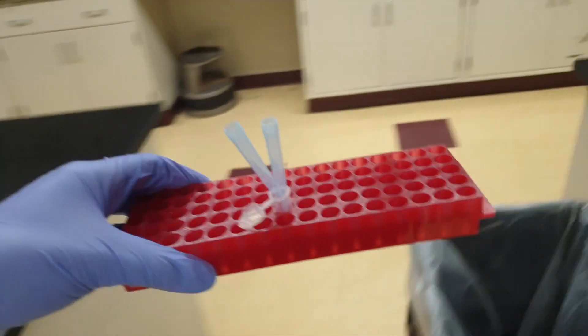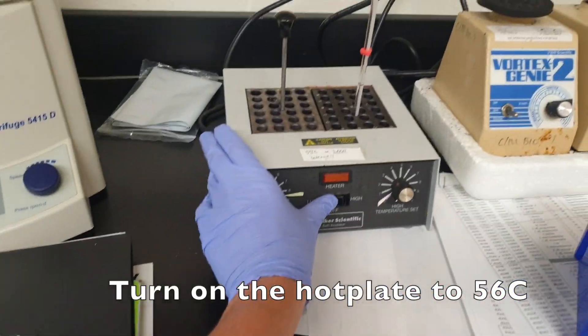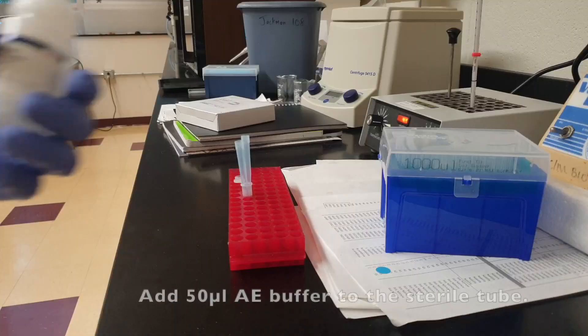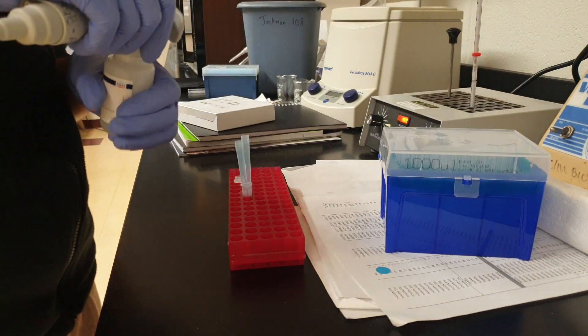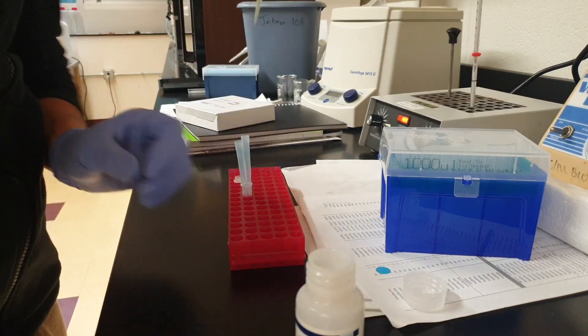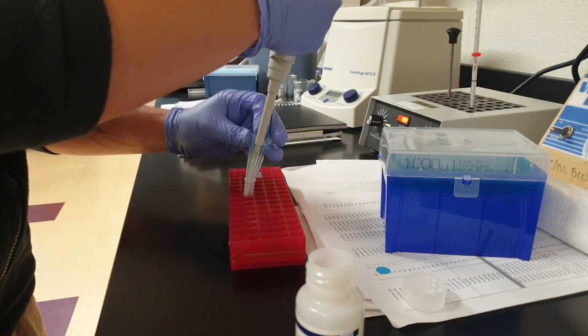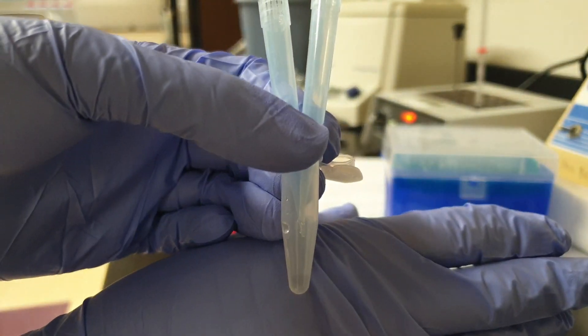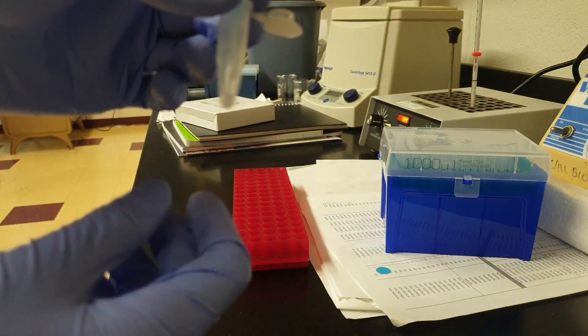Alright, back to the lab. Turn on the hot plate to 56 Celsius. Let's grab some AE buffer. Now, AE buffer right here. We're only going to need 50 microliters. And then just put it into the 1.5mm tube. So right now what we have is two tips and 50 microliters of AE buffer.